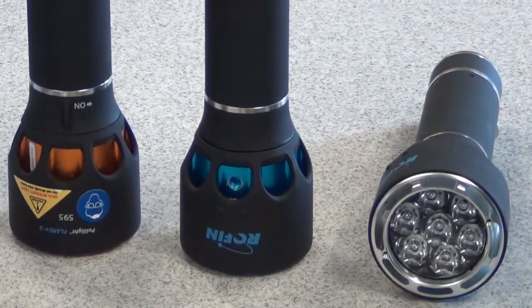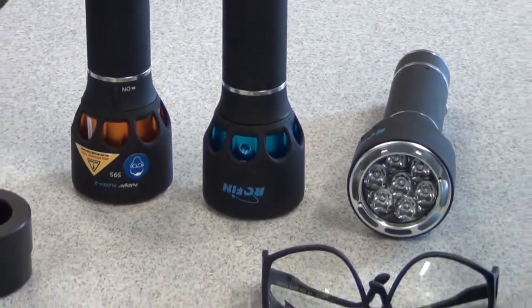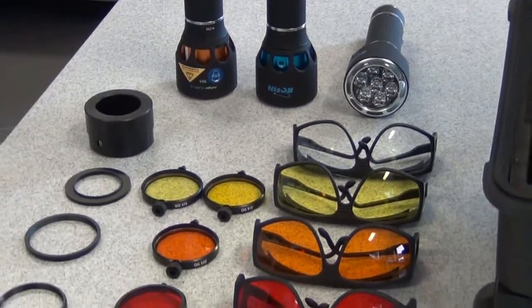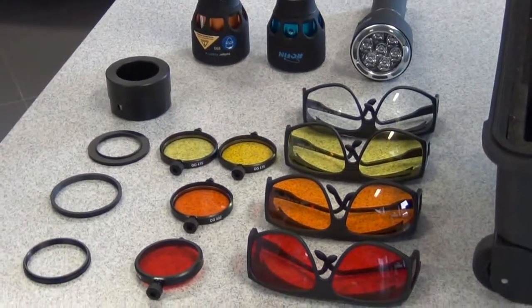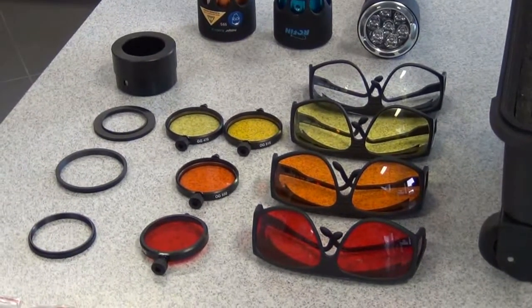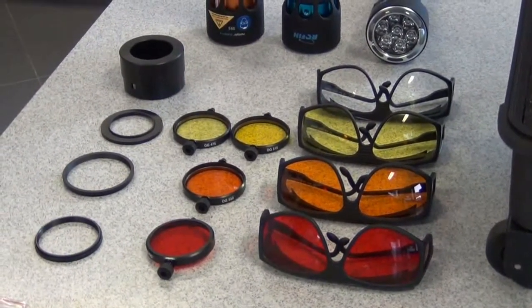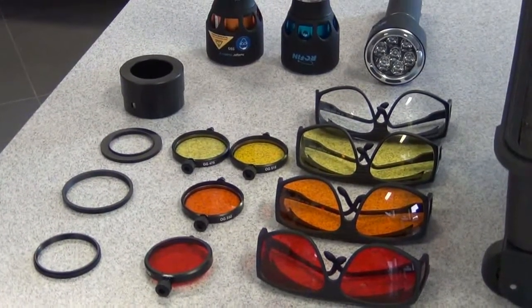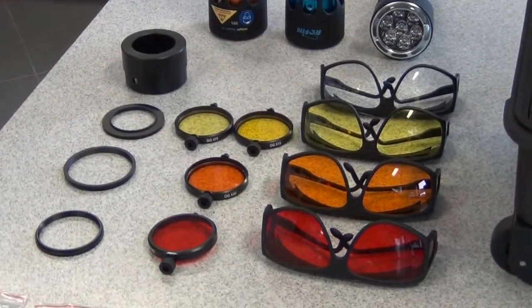Welcome back everybody. I am now going to talk about some of the components inside the Polyflare Plus 2 Forensic Light Source Kit. In this case we are going to talk about the searching goggles, the barrier filters and the camera adapter. We've got four searching goggles: the red, orange, yellow and the clear one. The colored ones are used for fluorescent searching purposes.